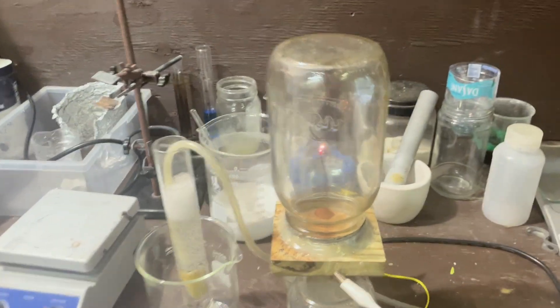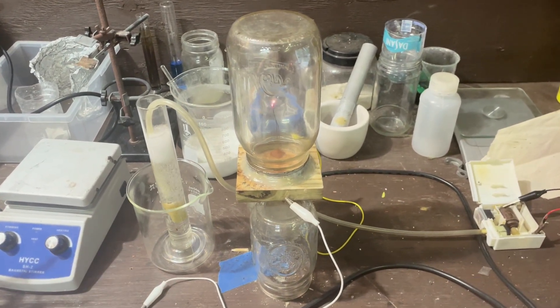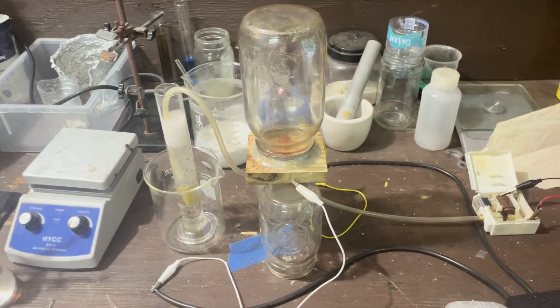Now I just got to start a timer. I'm going to be running this on and off for a couple days, and we're going to come back and see how much acid we got by the end. I'll come back in the middle in case something goes wrong or something interesting happens.